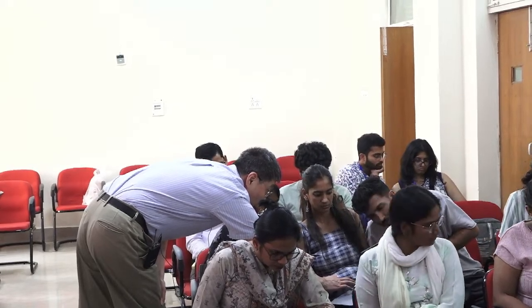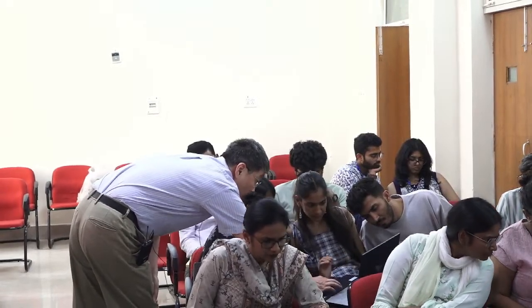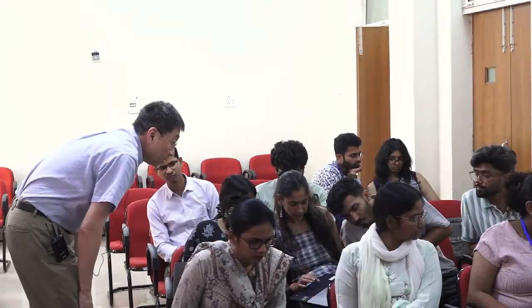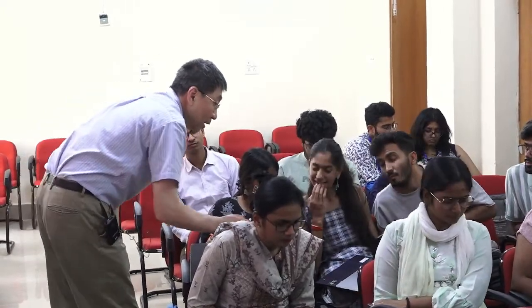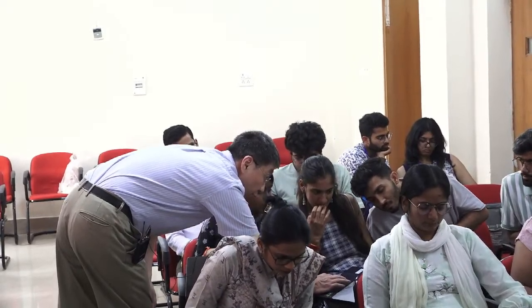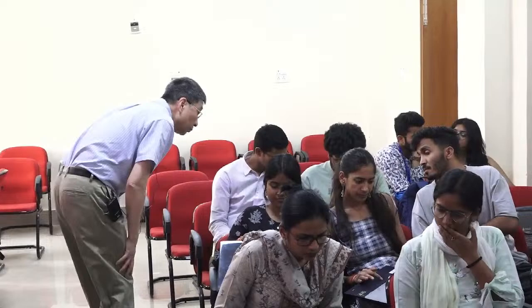Right here. So that's the phenylalanine right here. Click on that. Oh, I'm clicking the wrong way. How do you do clicking on this? It's not doing the right thing. It should tell you what residue number that is. Do you know what the residue number of the phenylalanine is? Can you click on the phenylalanine? What's the residue number?